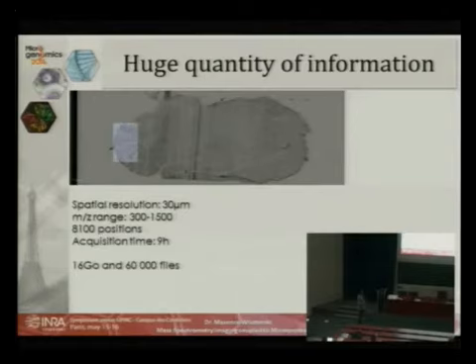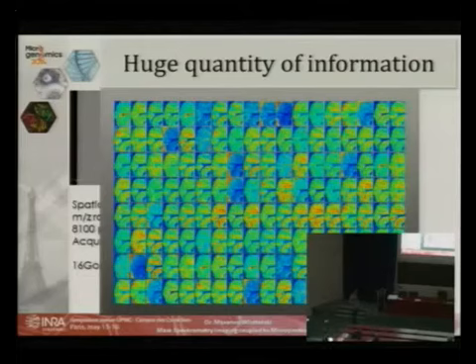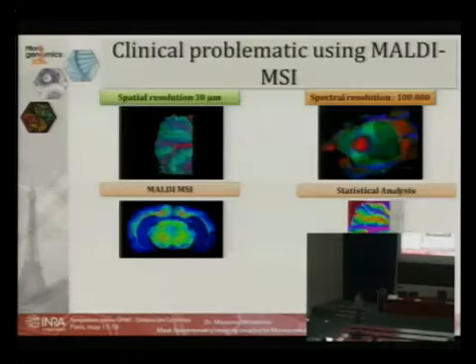And on all these spectra, you can find more than 500 peaks corresponding to different types of molecules. It gives really abundant information from only one analysis. And after, you have a lot of different software you can use to better understand this data.